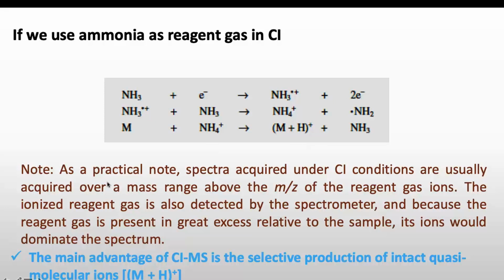But as a practical note, spectra acquired under CI conditions are usually acquired over a mass range above the m/z of the reagent gas ions, because we are using these gases in excess. So if you don't do it above the mass of the reagent gases, you will also see a significant peak of the mass for these gases. The ionized reagent gas is also detected by the spectrometer, and because the reagent gas is present in great excess relative to the sample, its ions would dominate the spectrum. So the main advantage of CIMS is the selective production of intact quasi-molecular ions, that is M+H, meaning you will get the mass of your molecule instead of fragments of your molecule, which was the disadvantage of the EIMS method.